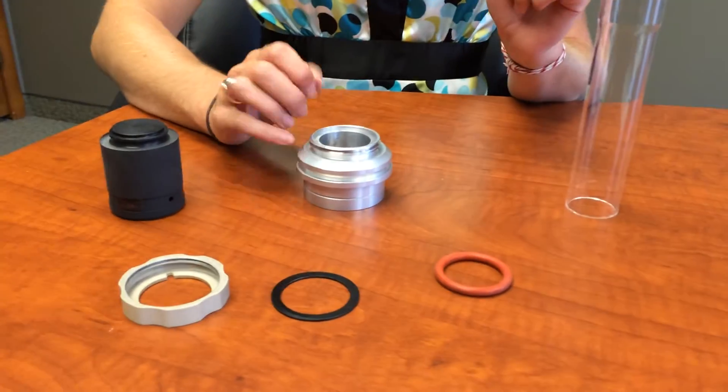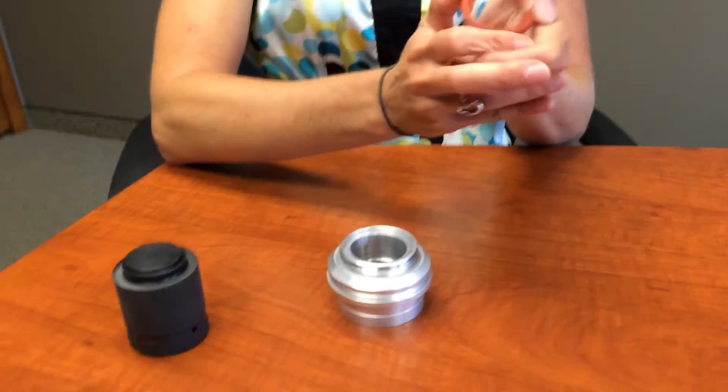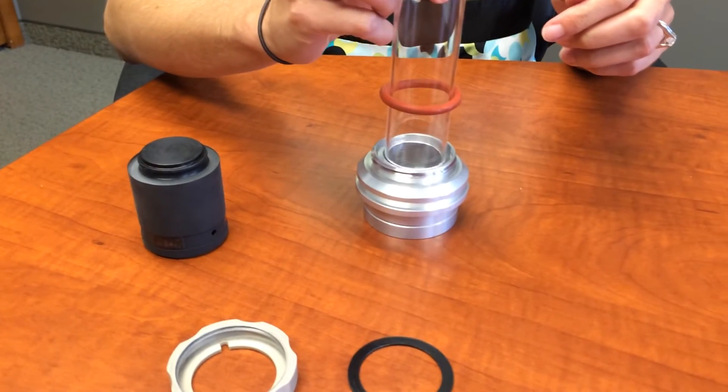Place base right side up, put O-ring on combustion tube, rolling it up high enough so that it allows the combustion tube to seat completely down onto the metal insertion.